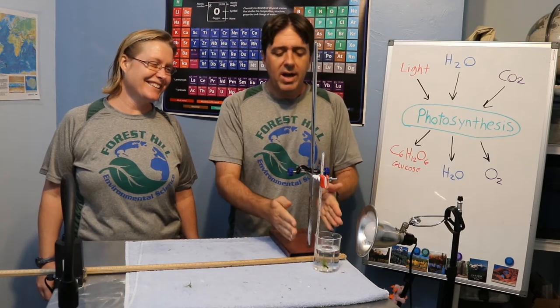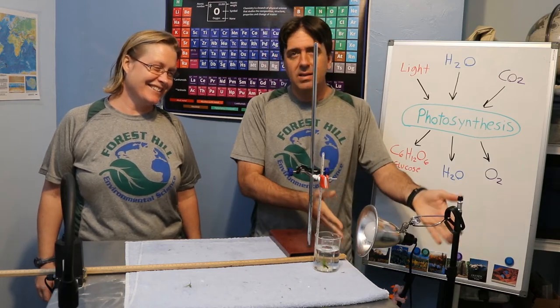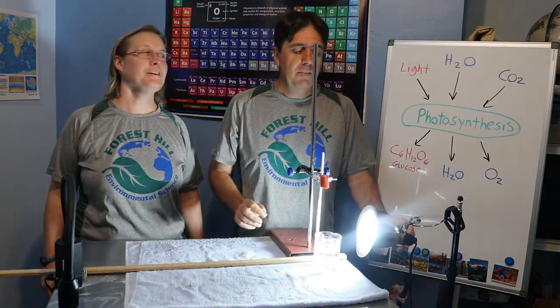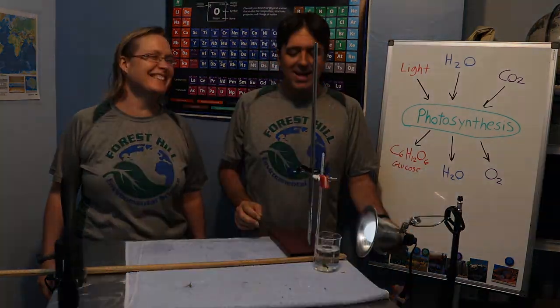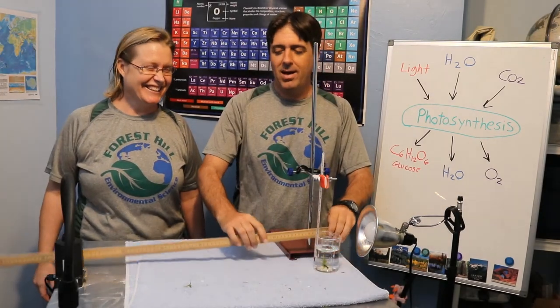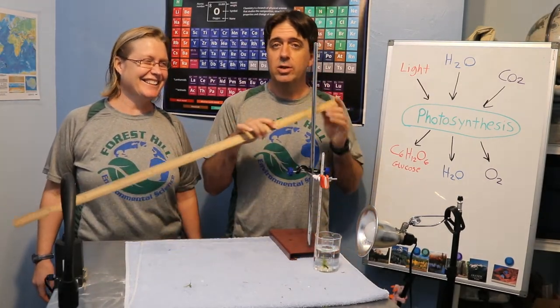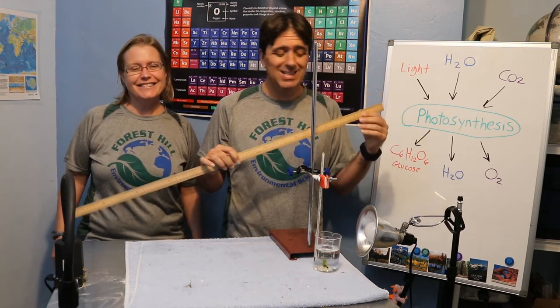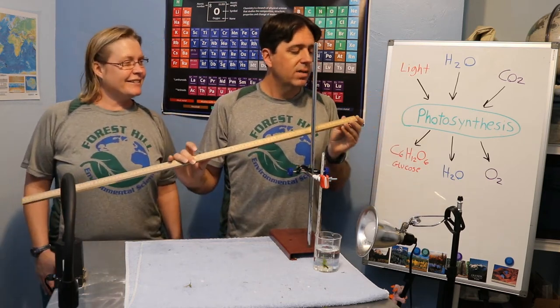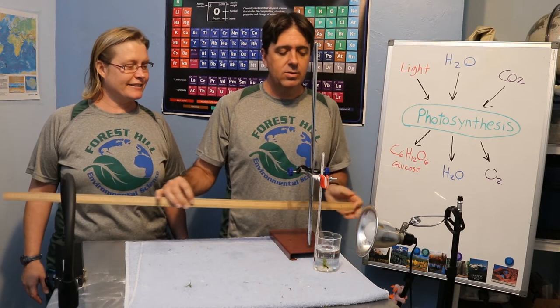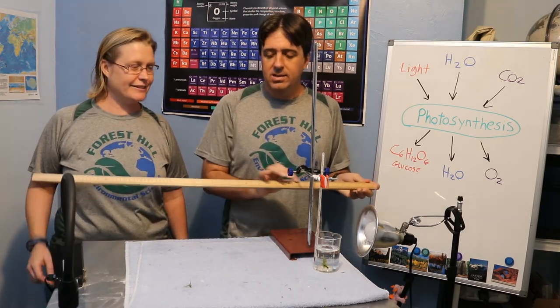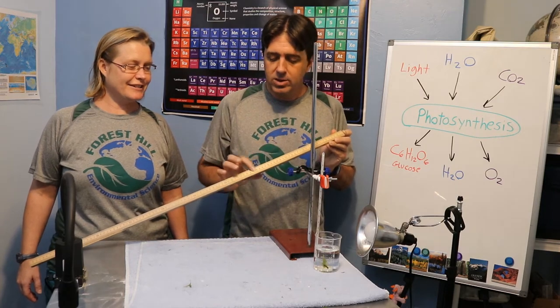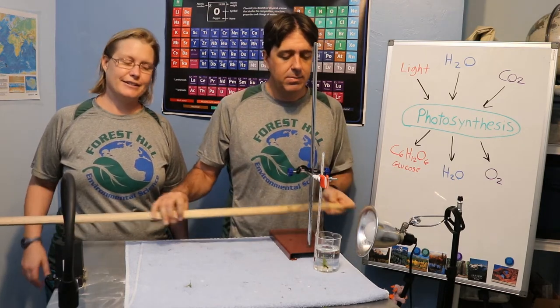My light is set up on a stand right next to it — I'll go ahead and turn it on. I have to measure the distance because we're going to use different distances from the light to control intensity. The zero end of the meter stick butts right up against the light and extends outward. We are going to test at zero, 10, 20, 30, 40, and 50 centimeters away.